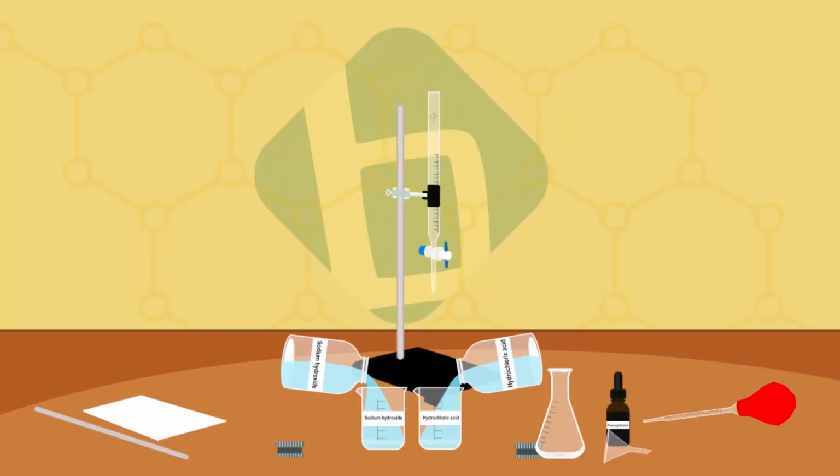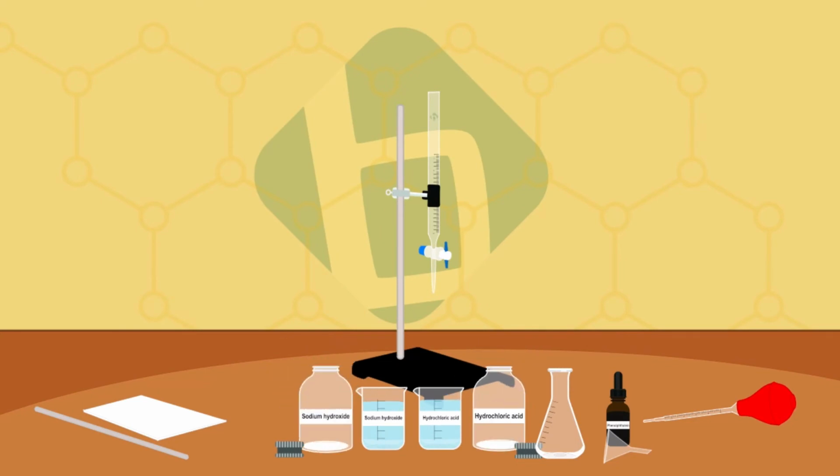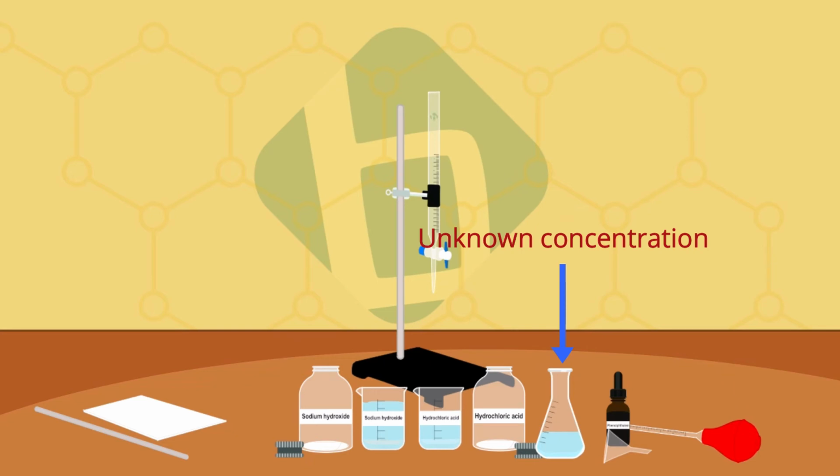Collect some of the chemicals in the individual beakers that have been properly labeled. Using a pipette, add 25 milliliters of the hydrochloric acid solution from the beaker to a conical flask. The hydrochloric acid solution is of unknown concentration. Add 2 drops of phenolphthalein indicator to the conical flask containing hydrochloric acid.